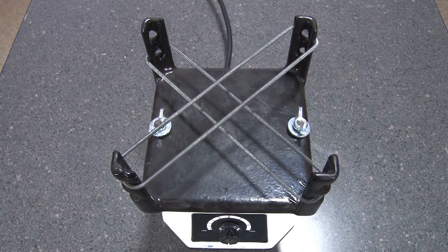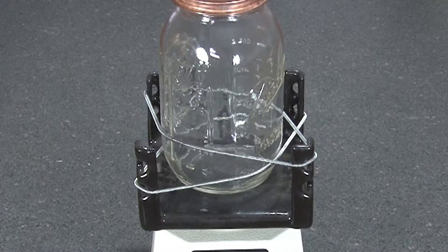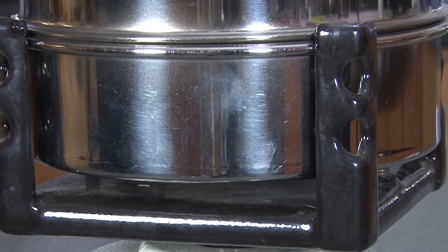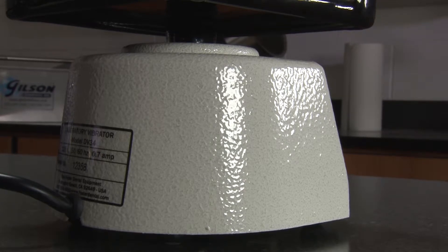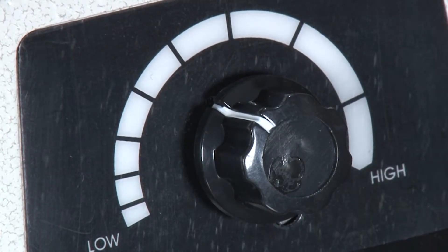The Gilson SS-28 has a plastic coated test platform and uses a spring clamping system that easily adapts to different shapes and sizes of pycnometers and sieves. Corner pillars hold flasks and larger pycnometers in place, and the unit's base has a tough scratch-resistant painted surface with a conveniently located vibration intensity control knob.